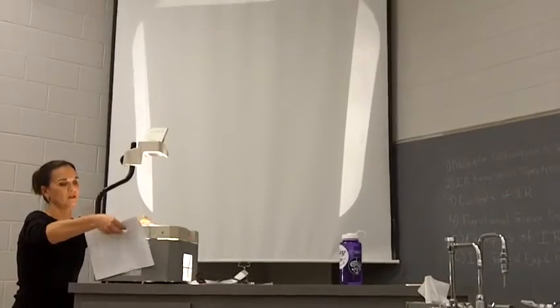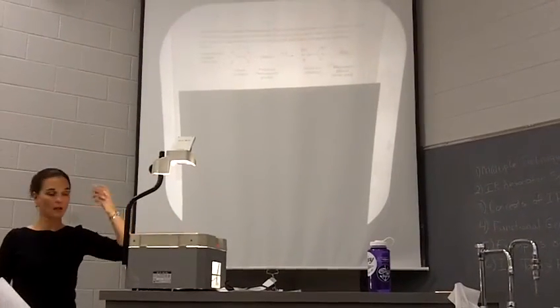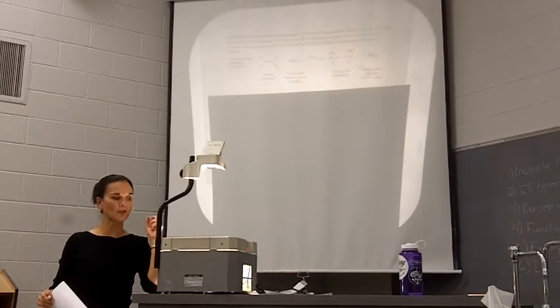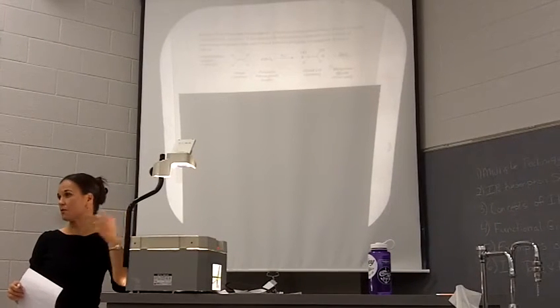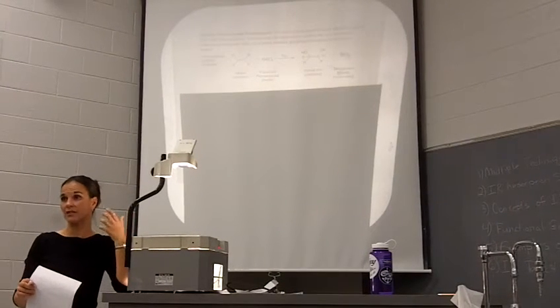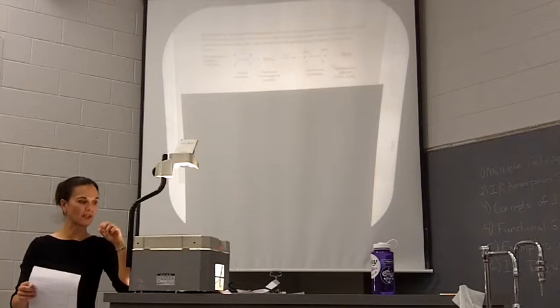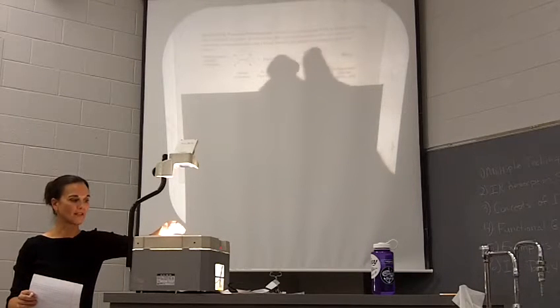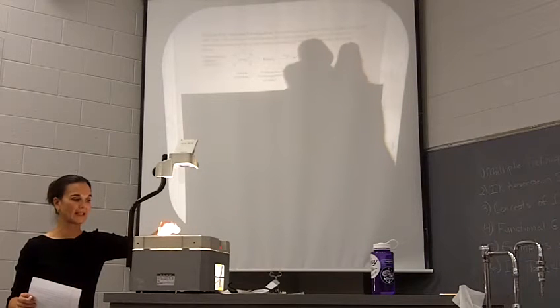And so you'll have your alkene, again, colorless, dissolved in acetone. You add 1 drop of potassium permanganate, which is really deep, like most of you used it in Gen Chem last year, that deep, almost black purple color. 1 drop of it, and it will react across the double bond to give you the diol. It also forms manganese dioxide.